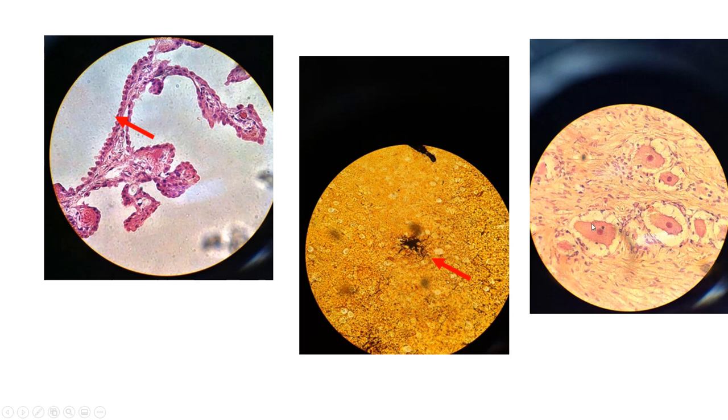And then over here, it won't make a whole lot of sense right now, but this is a dorsal root ganglion, which is right outside the spinal cord. Dorsal root ganglia contain sensory neurons. So these are sensory neuron cell bodies. And the cells that surround them would be the satellite cells that we talked about, a type of neuroglial cell.